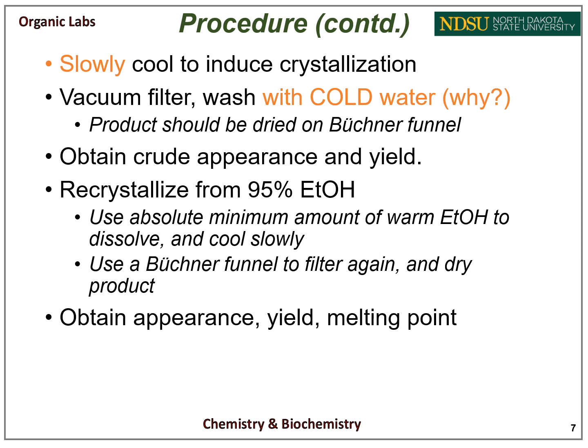After reflux, you will cool your solution slowly to induce crystallization. This will be followed by vacuum filtration in a Buchner funnel, and your crystals are to be washed with cold water, as warm water will likely dissolve your product. Allow your product to dry in the Buchner funnel by continuing to apply vacuum to suck out any more solvent. You will then obtain your crude appearance and yield.